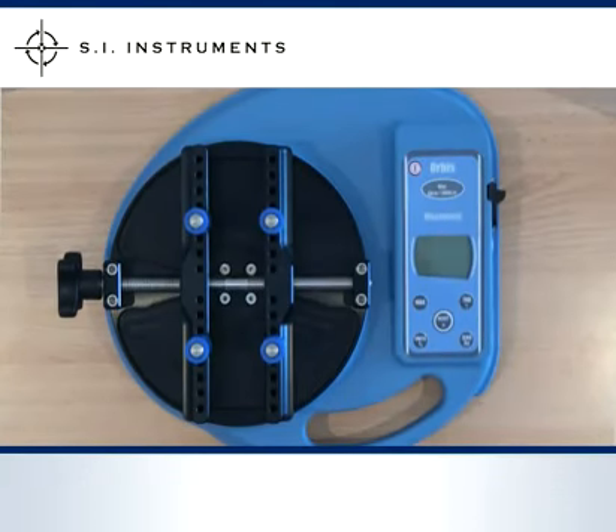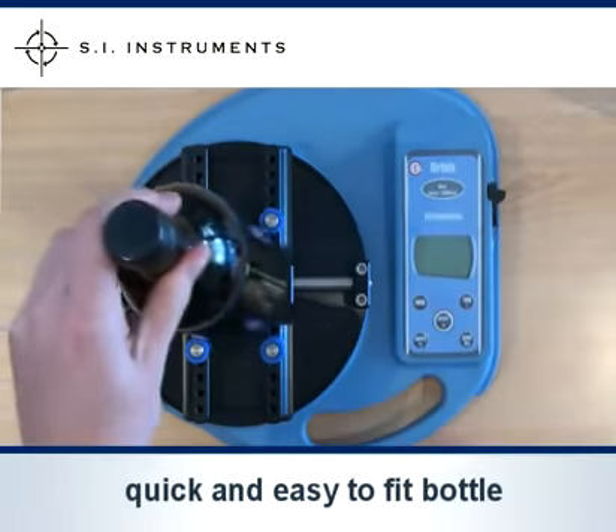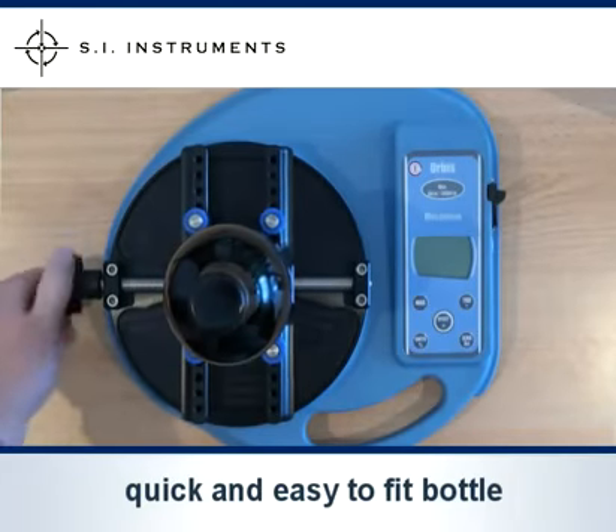In this example we are testing a cap on a wine bottle. You can see how quick and easy it is to fit the bottle ready for testing.